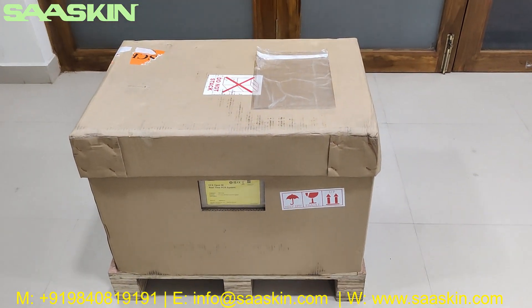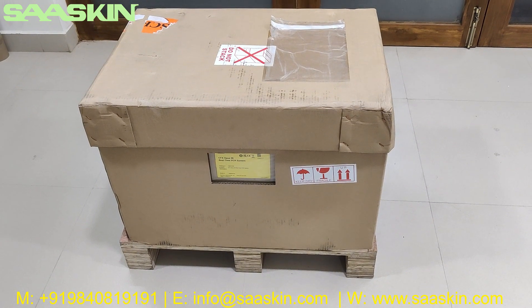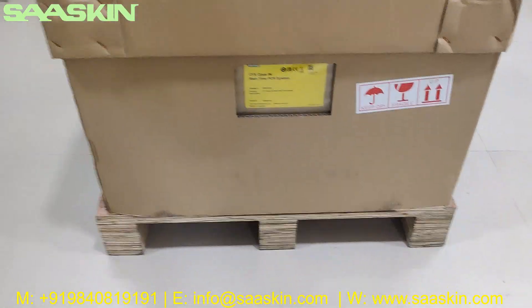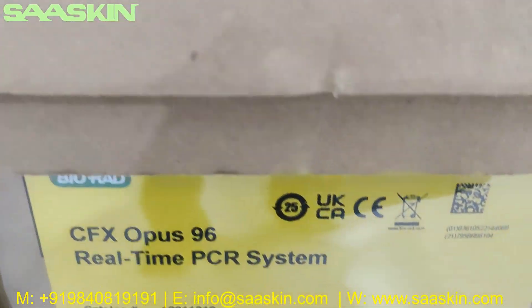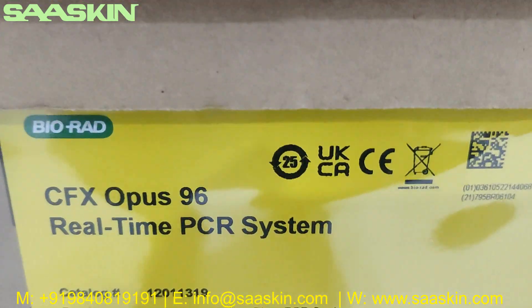Hello everybody, today we're going to see the unboxing of the Bio-Rad CFX Opus 96 real-time PCR system. This is how the box looks like — it actually comes with a pallet. This is a CE-certified product from Bio-Rad.